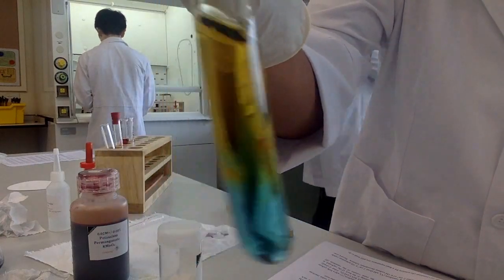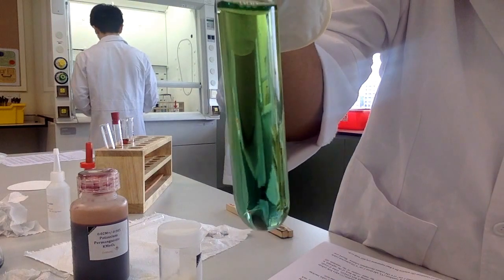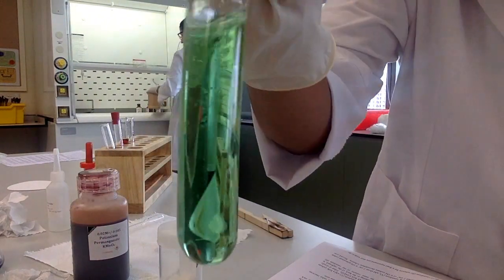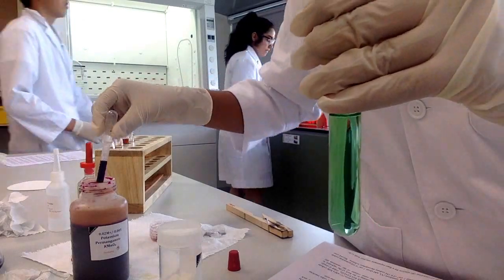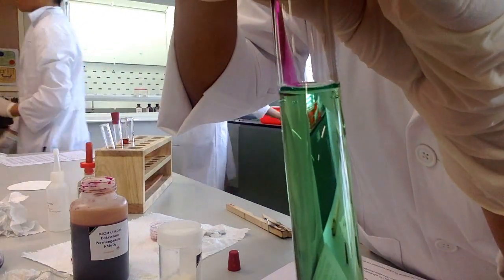It doesn't change the color, but this one changes the color, and this changes the color too. I don't know, it changed the color too. This one changes into yellow, this one into green, blue — or it's just yellow, I don't know, it's just yellow.